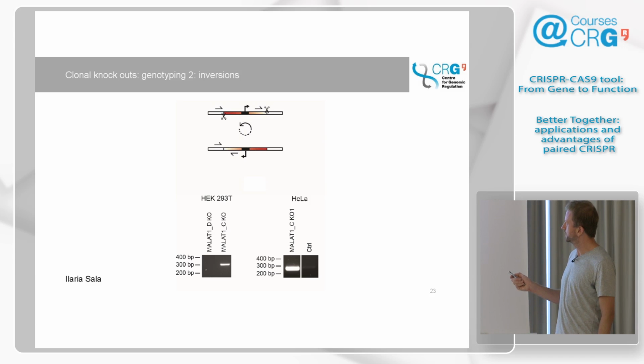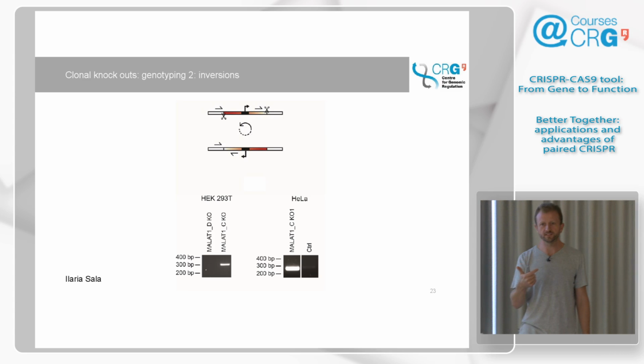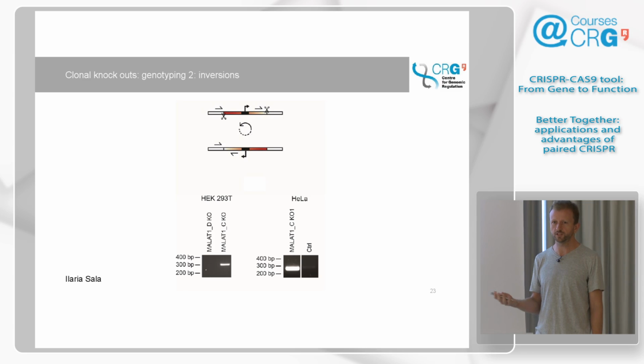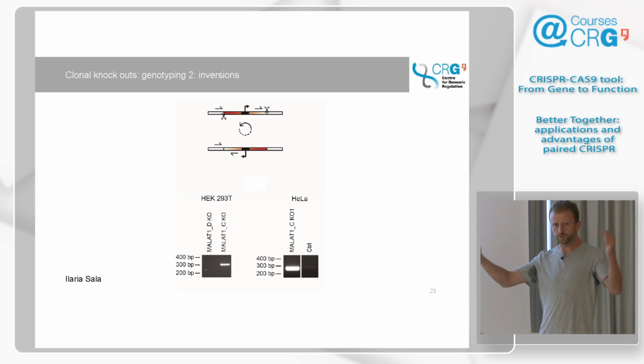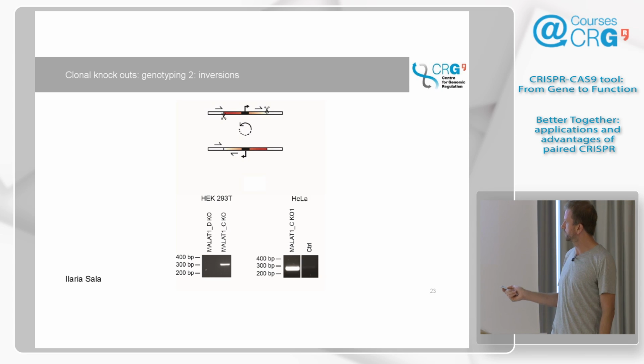And then we realized: you put in two primers pointing like this, and you start to see a band in some of the cell samples. So what's happened is that in particular clones you've had this switch, and you see the phenotypic effects that you expect from a deletion, but when you do the PCR with the two primers outside, you still see a long product, and that's the reason. We see this a lot of the time.